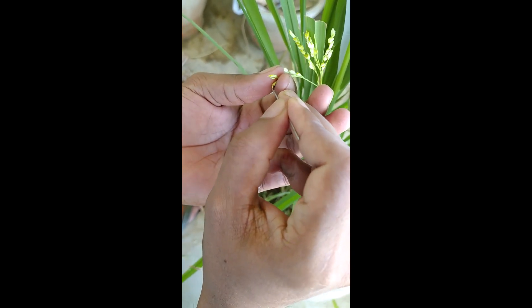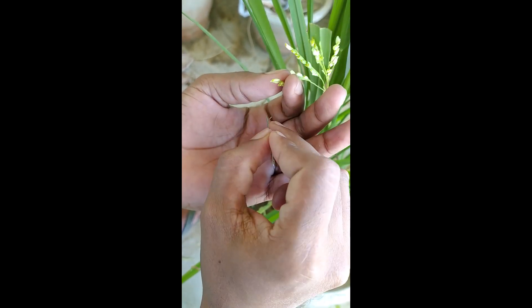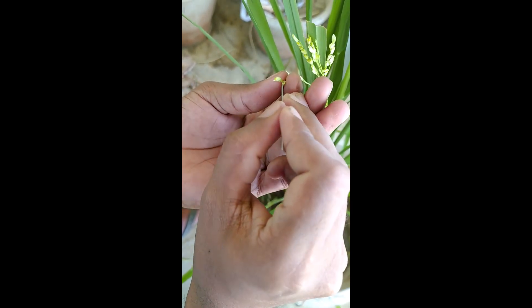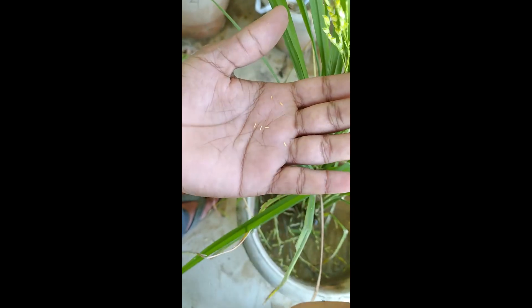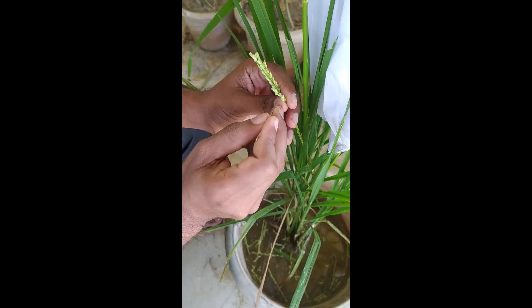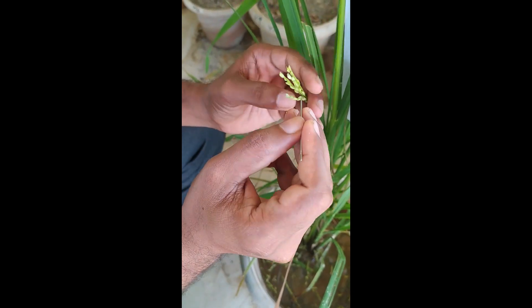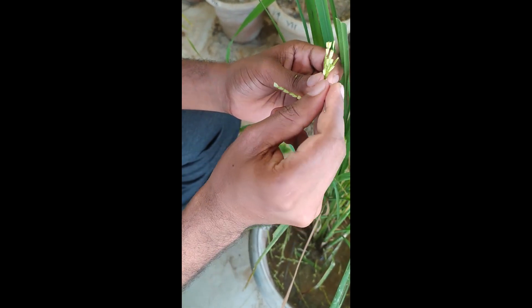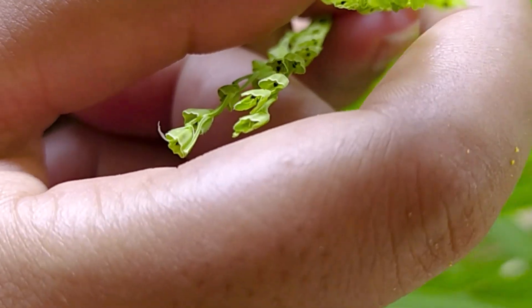From each individual flower, 6 stamens have to be removed carefully without damaging the stigma. Similarly, we will remove all the stamens from the individual flowers. In the end, only one bifurcated feathery stigma should remain, and with this emasculation is over.